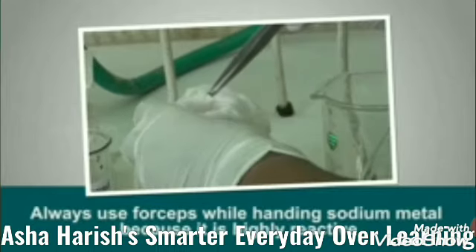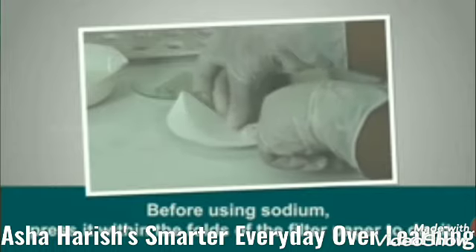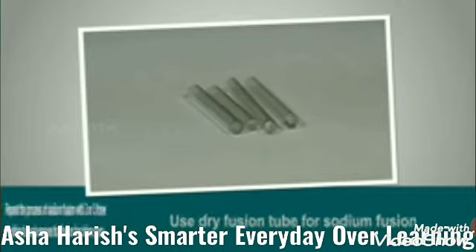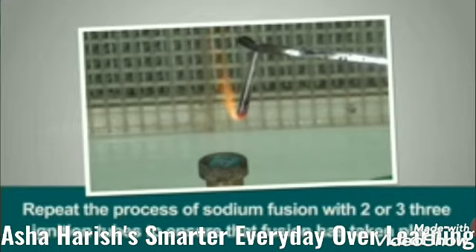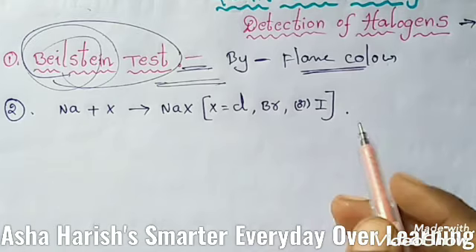Now what are the precautions? Always use forceps while handling the sodium metal because it is highly reactive. And before using sodium, press it within the folds of the filter paper to dry it. And use a dry fusion tube for sodium fusion. And repeat this process of sodium fusion with 2 or 3 ignition tubes. Ensure the fusion has taken place. And right, that's about the preparation of Lassaigne extract.